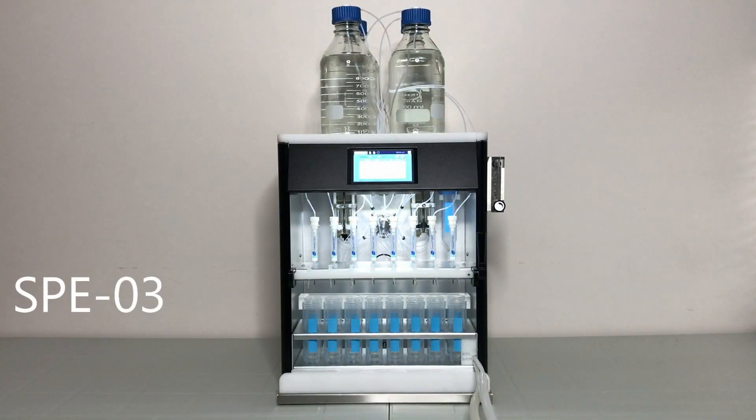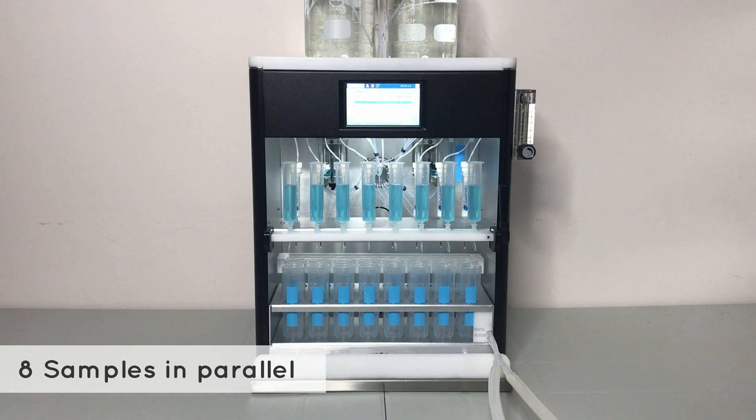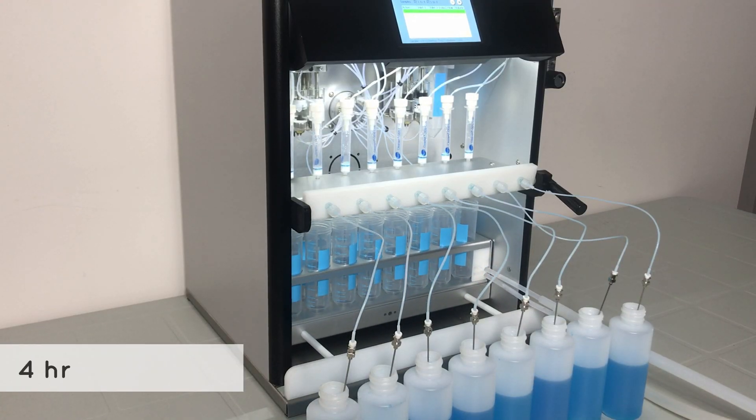This is the all-new SPE03, an 8-channel automated SPE system capable of cleaning up to 8 samples at a time. Imagine a 4-hour clean-up of large volume water samples reduced to just 30 minutes.